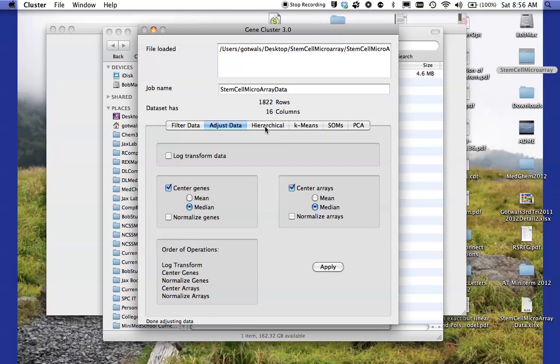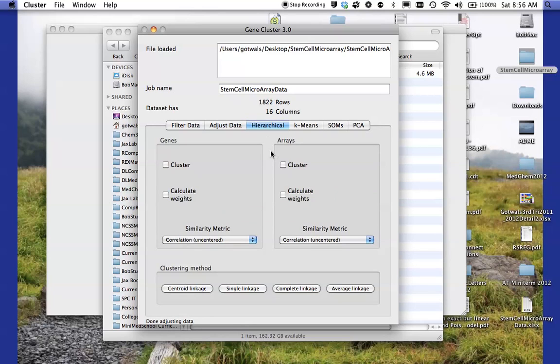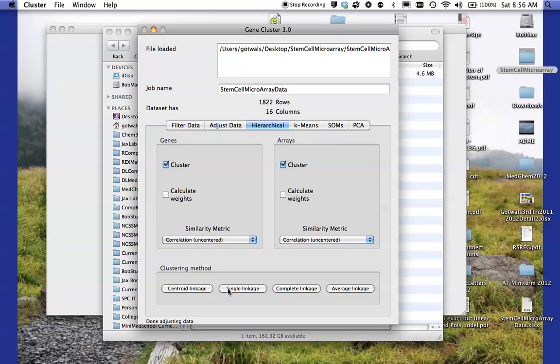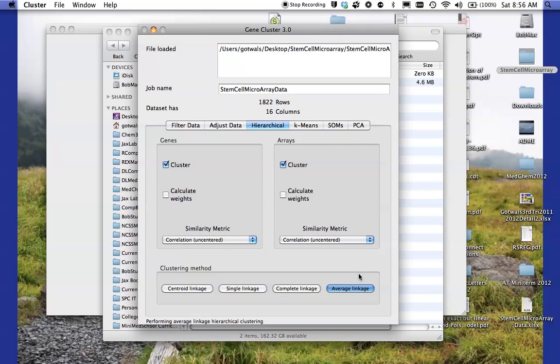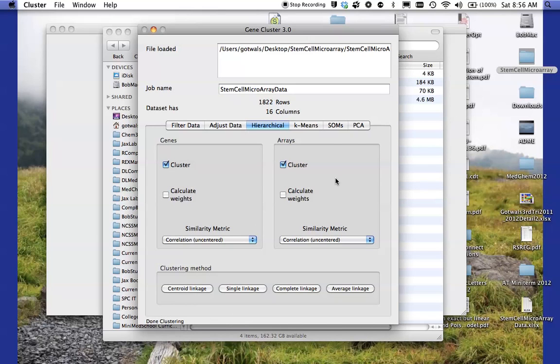Now I'm going to go up here to the next tab hierarchical. And what I want to do is I want to say I'm going to cluster the genes and I'm going to cluster the arrays. And there are four different clustering methods. They all have a little different approach. And I'm just going to go ahead and choose, this is the most, probably the most standard one, the average linkage type. I'm going to click on average linkage. And it'll take a minute and you wait for it at the bottom there to say done clustering. At this point you are done with cluster. So I'm going to quit that and close.